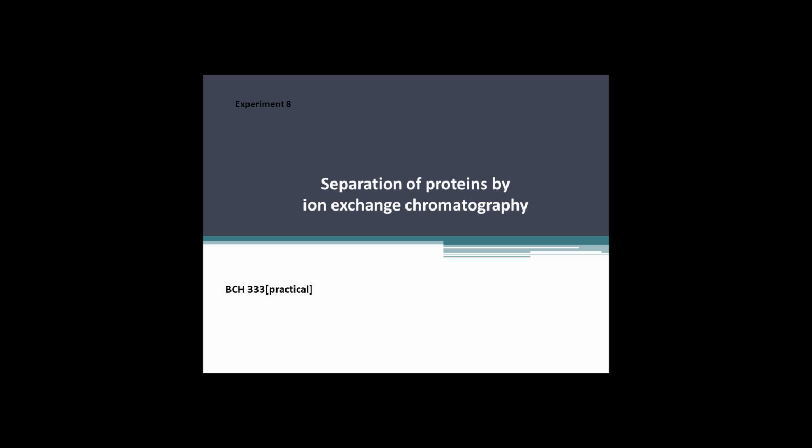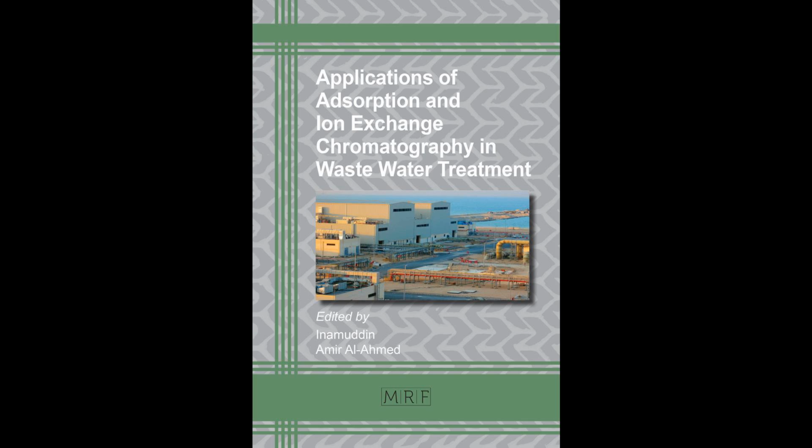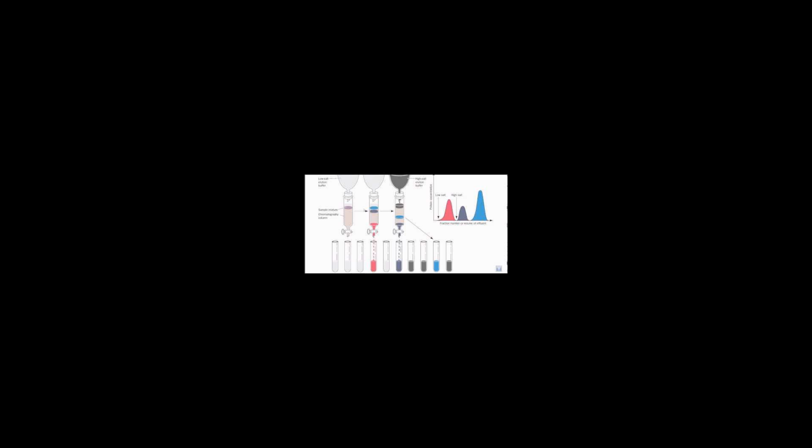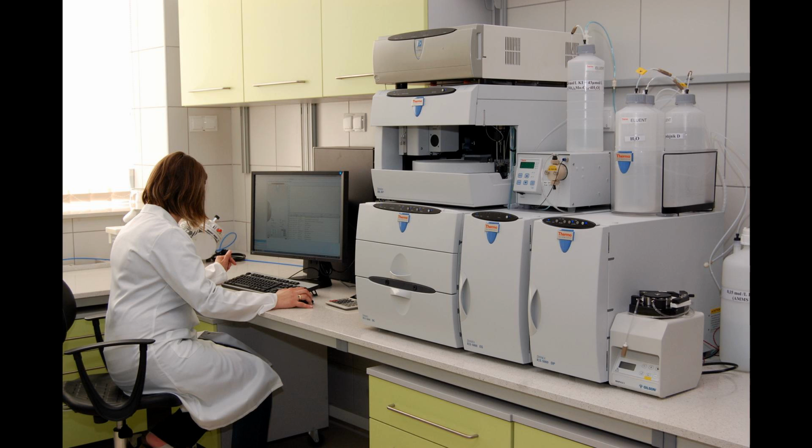Both of these techniques can displace the negatively charged protein, which is then eluted into test tube fractions with the buffer. The separation of proteins will depend on the differences in total charge. Composition of ionizable side chain groups will determine the total charge of the protein at a particular pH.